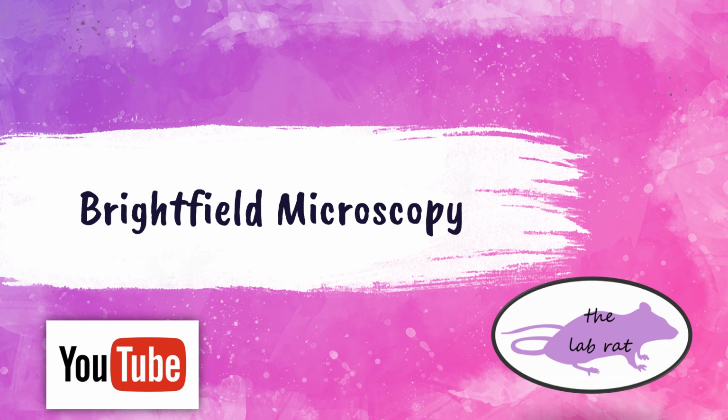In this video I'm going to be discussing the use of the brightfield microscope. Alrighty, let's get started.